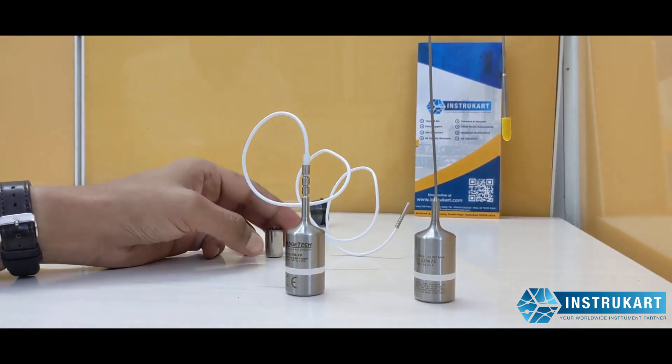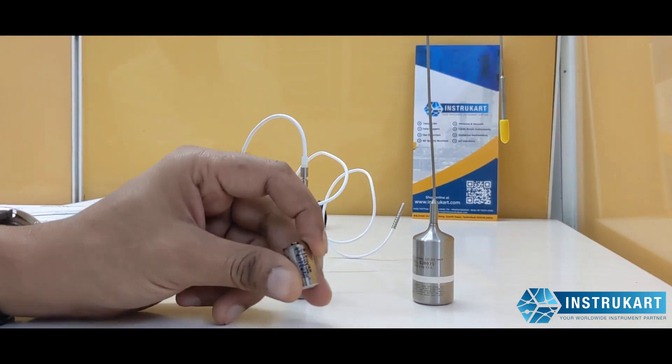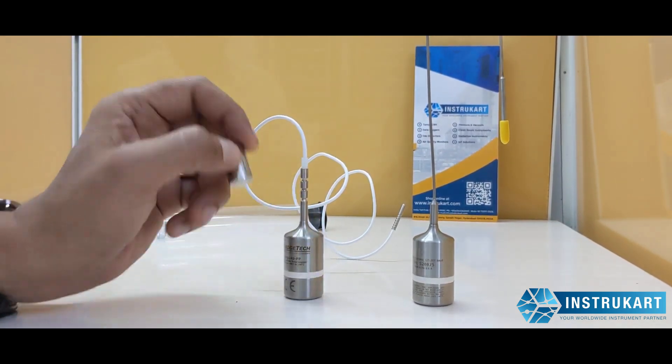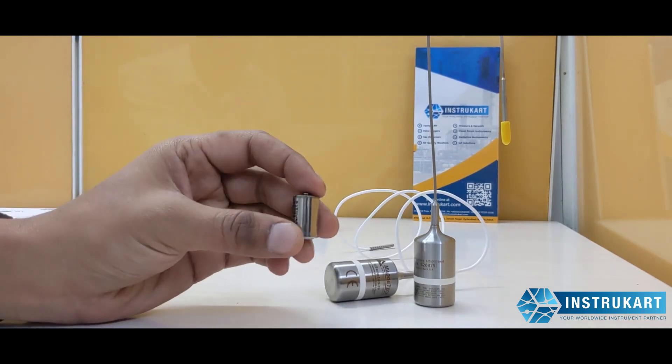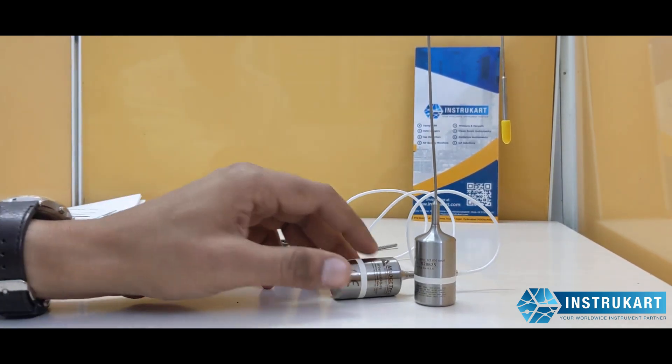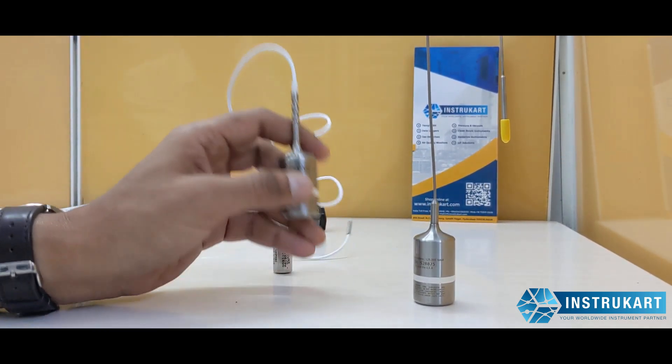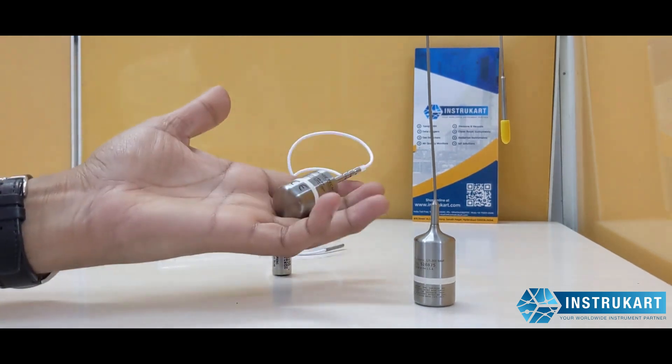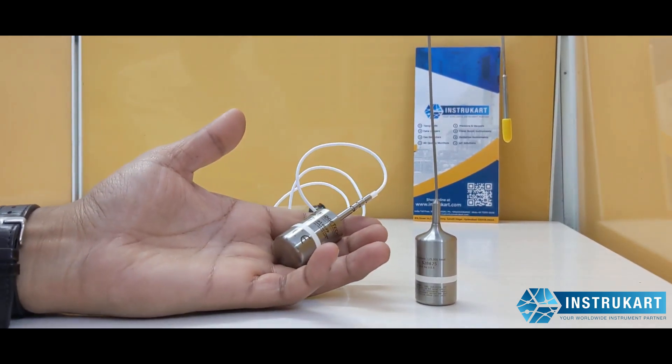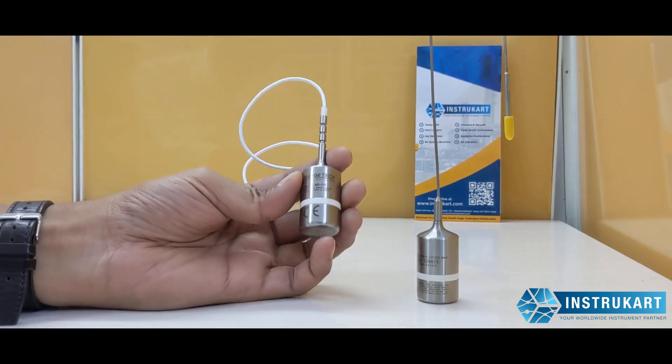The battery type is 3.6 volts lithium battery and the battery life is typically one year. The weight for these loggers is around 120 grams and it has CE approvals.